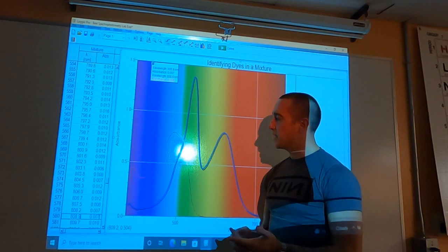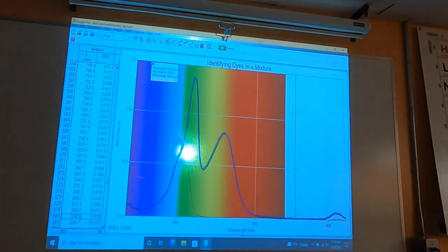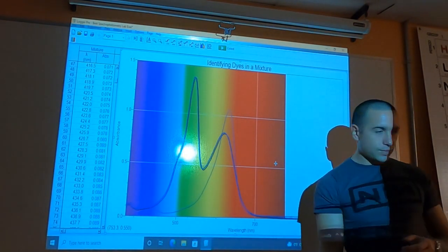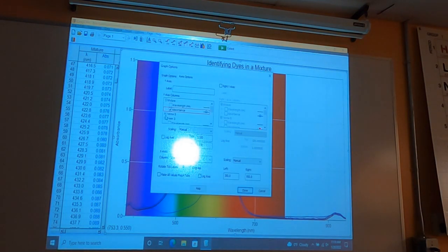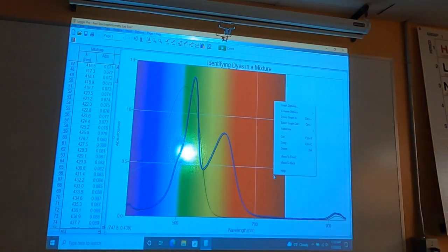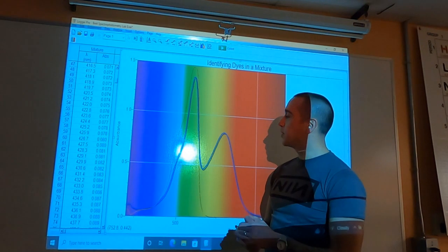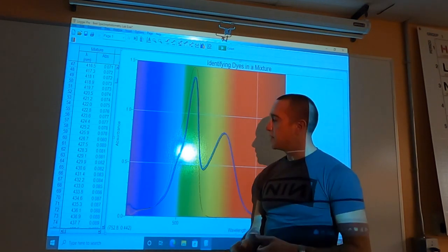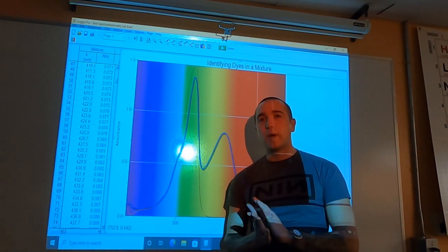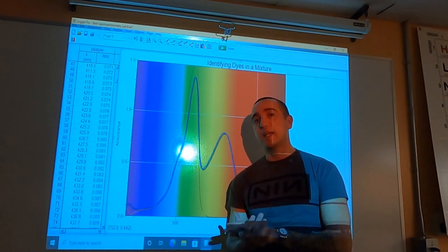So one at a time I'm going to go through. First is yellow 6 and you see yellow 6, the peak, does not match any of these. And so I'm going to try the others. Green 3 is no match. Red 40 also is not a match. Now red 3 seems like it is going to be part of this mixture. Though the heights are different because the concentrations were slightly different when I was pouring out and watering down the cuvettes, the peaks are the same wavelength. And that's what's key here. So it seems very clear that red 3 is one of the dyes in this mixture.